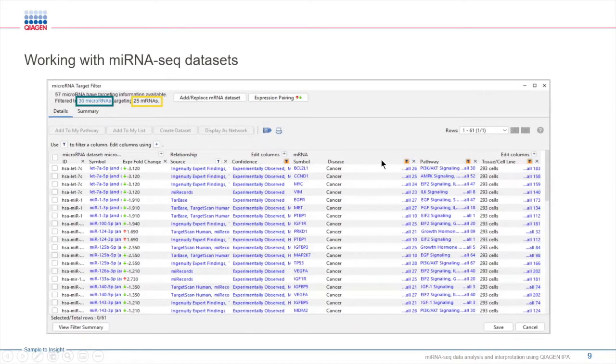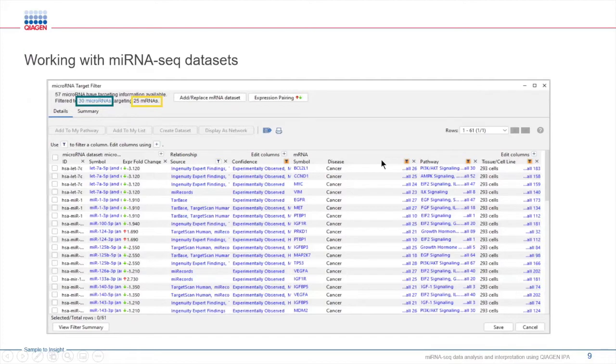For example, you can ask, can I filter by a specific pathway like PI3K signaling in the cell type that I'm studying, 293 cells? And using these different filters right here, you can easily do so. This is going to save you hours that would have been spent in the literature.